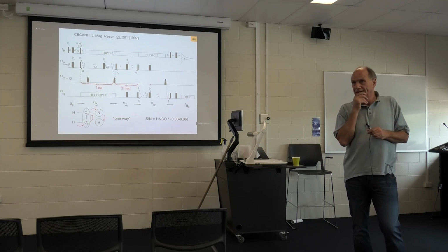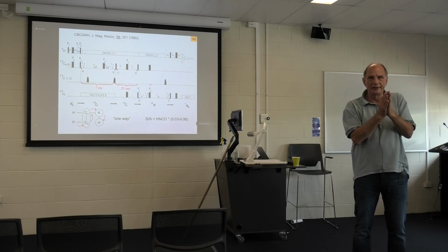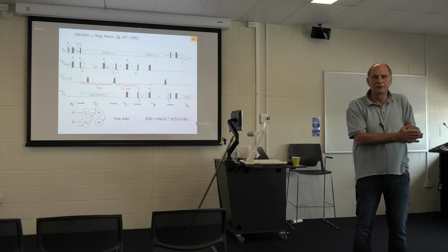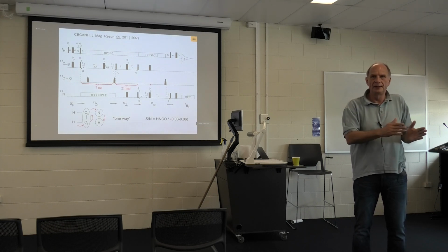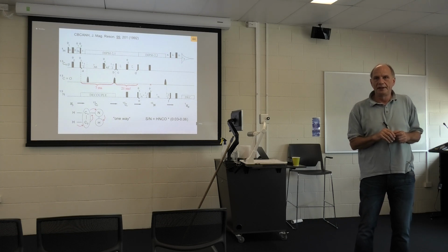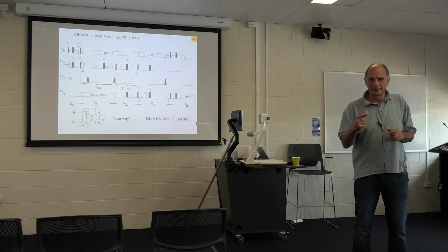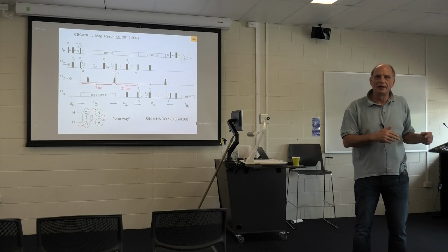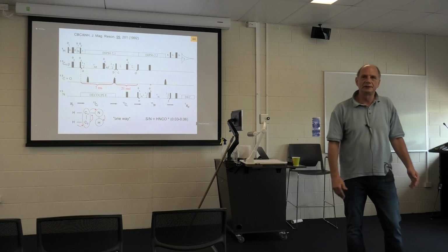The other thing that I can think of is the mobile C-alphas. They are very strong relative to the weak C-alphas because they feel the full scale of all the different mobilities. The amides may also feel this, but the ones that are highly mobile exchange with water and are attenuated again.